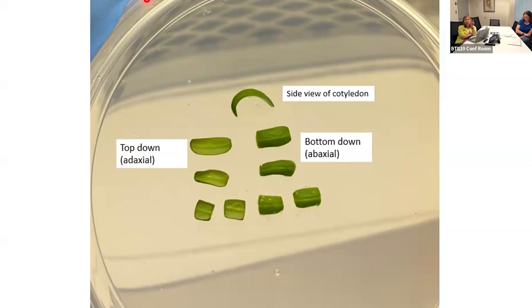So that sometimes if one doesn't work, the other one does, and then we've saved ourselves time. We also place our guide RNAs about 50 to 100 base pairs apart to really make sure we're getting a good knockout of expression. But it's just that we design the guide RNAs, do the transformations, and then look at that efficiency.